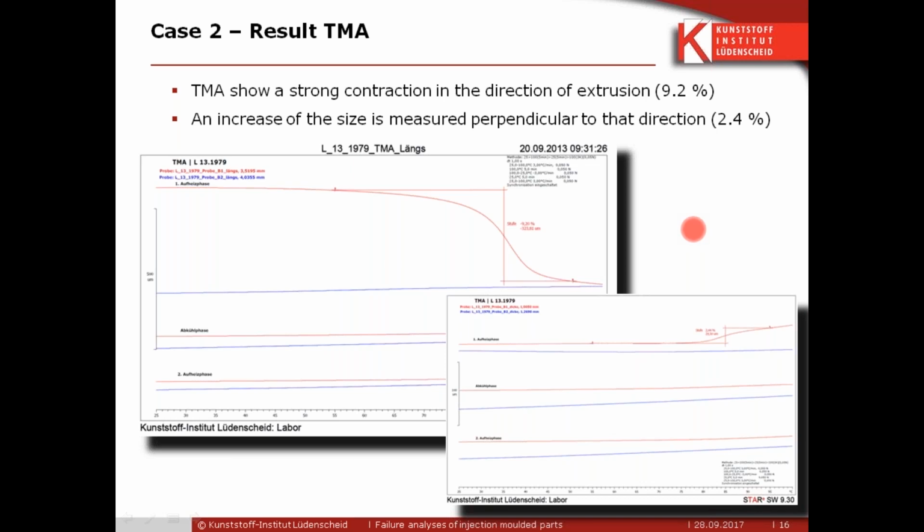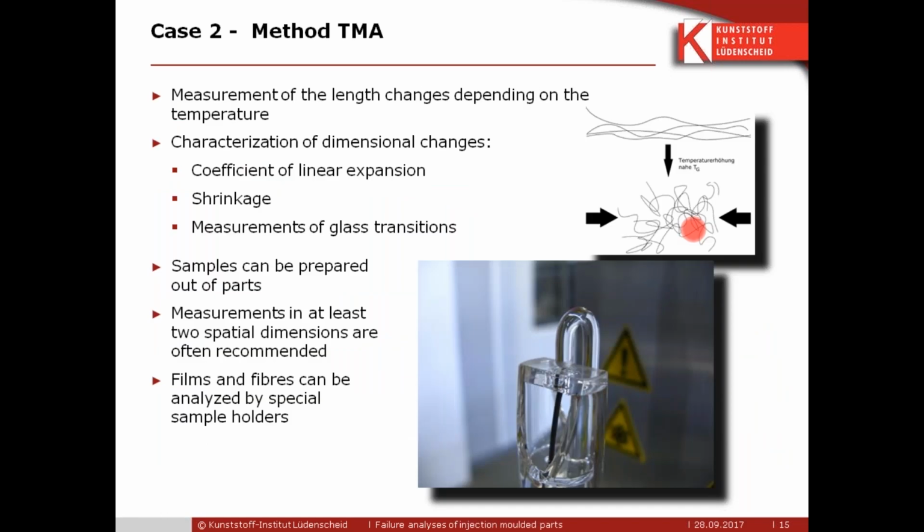If you only have a small effect, it's okay that this effect appears before you assemble the parts. I see that sometimes for thermosetting polymers, if you still have post-curing or something like that, then parts are very often annealed. But of course, if this annealing only produces contraction, shrinkage or dimensional change, this will alter the entire appearance of your part. So you should understand the production process better.